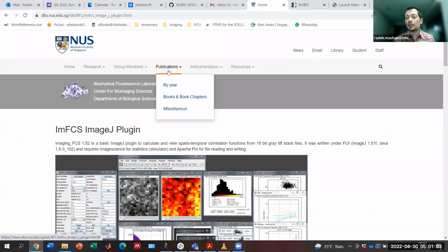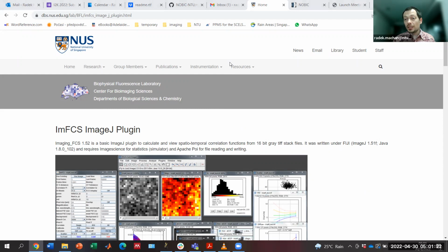So if you are interested in the technique, you can find all sorts of information here. And now that I've done with this introduction, let's go to FIJI and start the plugin.